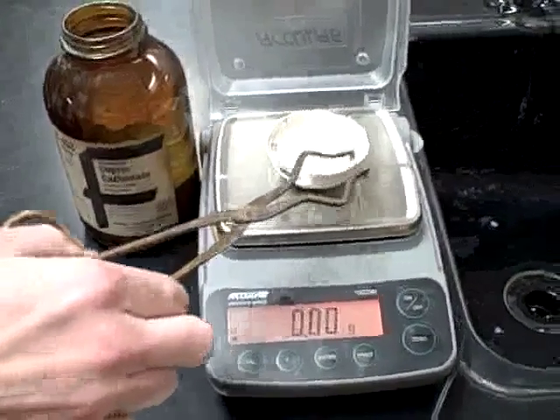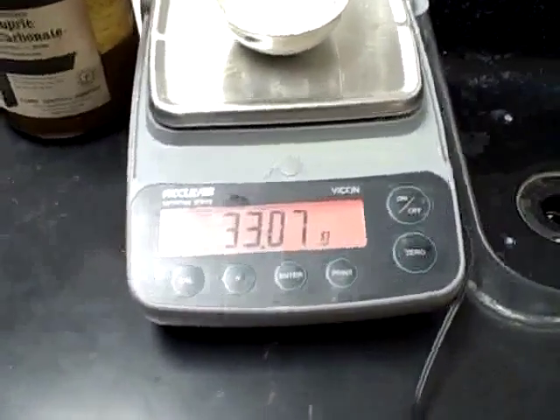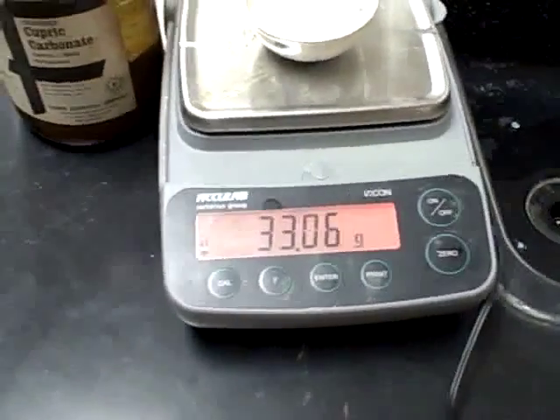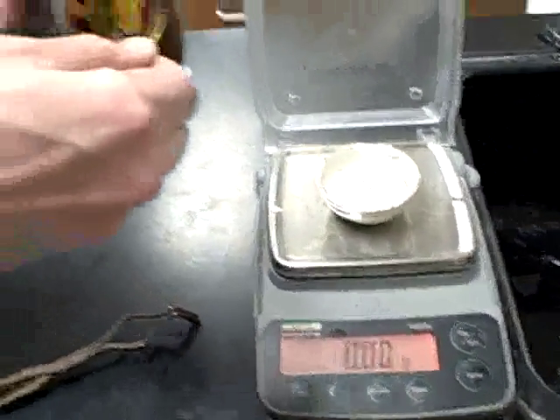To start, we have to mass a clean evaporating dish. Note that the mass of the evaporating dish is 33.07 grams. We will then add 1 gram of basic copper(II) carbonate powder.